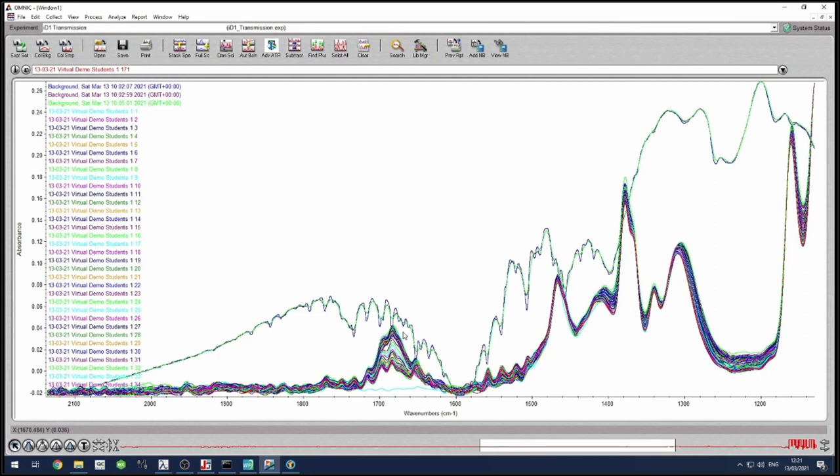And from these peaks, we would form our chemometric model. We would apply principal component analysis, and it would tell us that these are the peaks of interest, and it would, as I mentioned, show where the greatest variance was, and our principal component number one would probably track with temperature. So principal component two could be used to apply the chemometric model to.